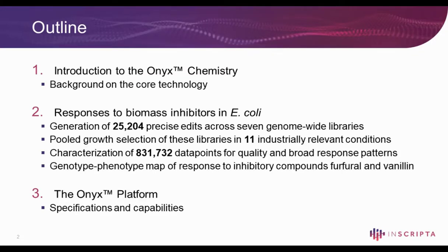So the outline of today's talk is that I'll start by giving you a brief introduction to the Onyx chemistry, just so everybody is on the same page regarding the core technology and principles for massively parallel genome engineering. Then I want to show you data on responses to biomass inhibitors in E. coli. I'll show you how we generated more than 25,000 precise and trackable edits across 7 genome-wide libraries, how we then pooled all the cells and performed growth selections in 11 industrially relevant conditions.